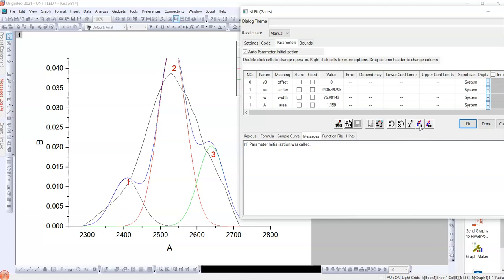We have our actual convergence spectra which could be fixed with the original FTIR spectra of OD, deuterium. This is fit until convergence which software will do automatically. However, I will prefer the one by one iteration technique by which we will have our original convergence spectra.